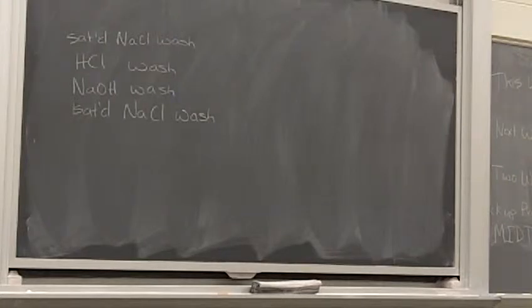And when we mean wash, when you're done with the reaction, we tell you to then add 10 milliliters of ether to the reaction. At this point, your reaction's done. So at the end, when you get to the workup, use red can ether, not the dry ether.